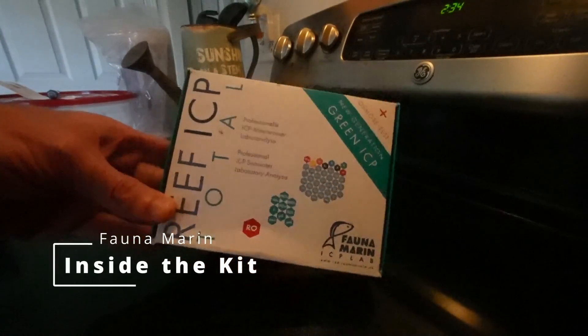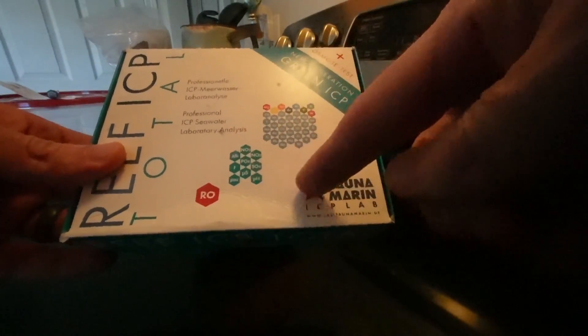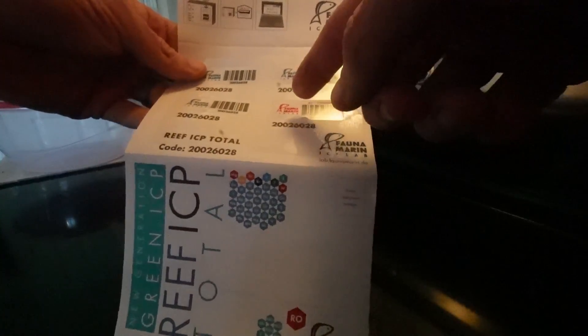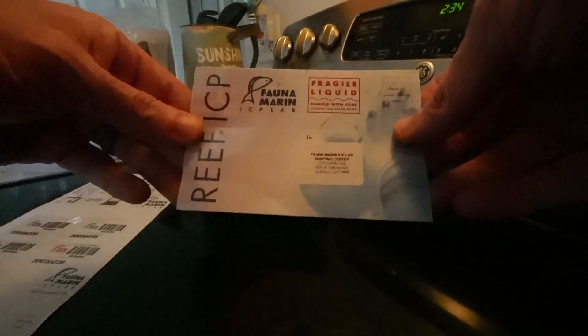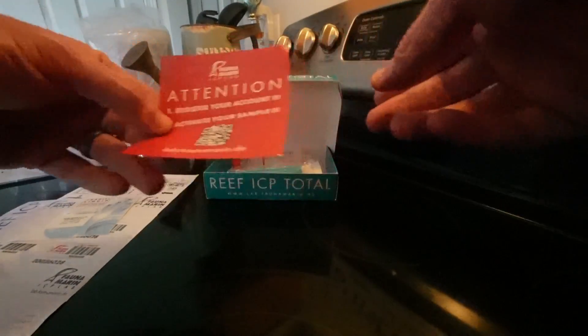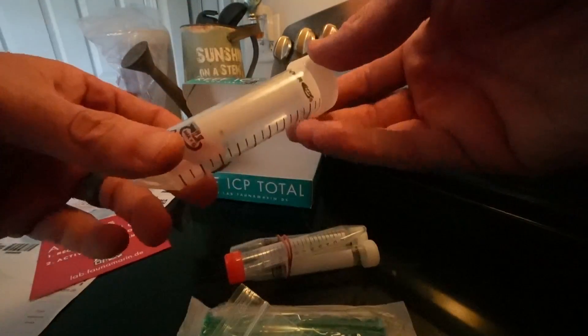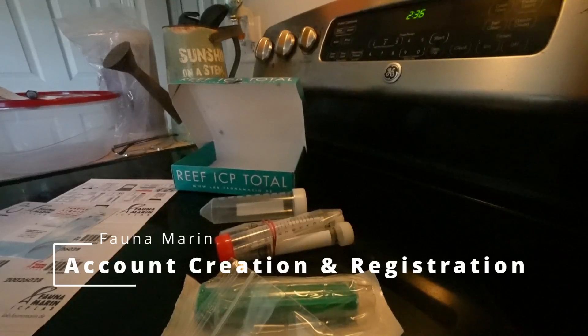First let's take a look at what we get inside the kit itself. Inside the box we get instructions, and we also get some barcodes for our samples. Based on these barcodes it looks like one is going to be for RO water and then we'll have three for testing. We also get an address label, a card to help us register our account, our test vials, a filter, and another test vial as well.